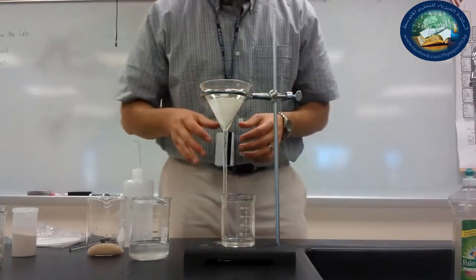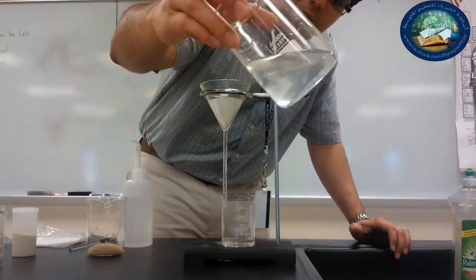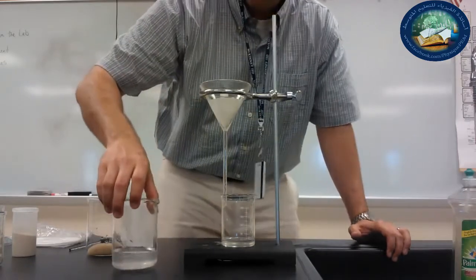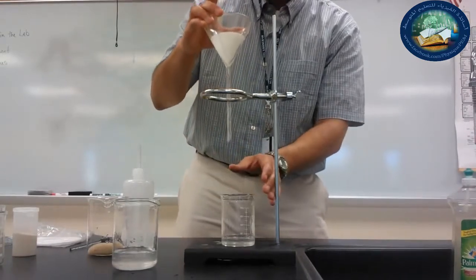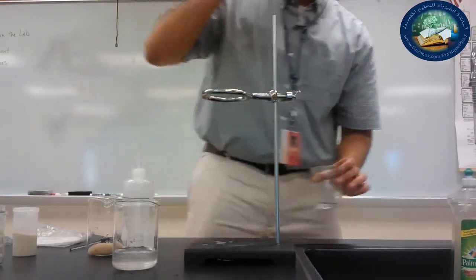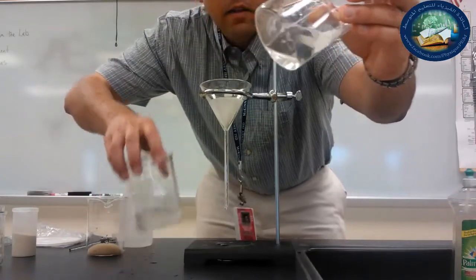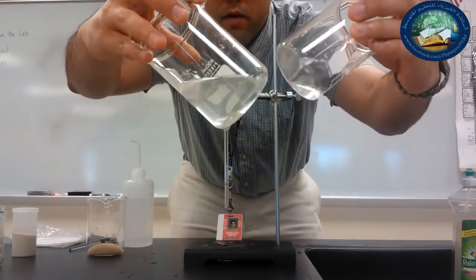All right, so I'm going to let it run down just a little bit, but I want to show you, again, notice that this liquid is kind of cloudy here. This shows us that there are some small particles still suspended in the water, some particles of sand. And I'm just going to remove this and put it to the side for now. You can still see there is some water, but I just want to show you the difference. So I'll pour this out. We're not going to do this anymore. And I will show you the difference. You can see how this water is much more clear than this water. This one's kind of cloudy. This one's clear, and this is the water that has been filtered.